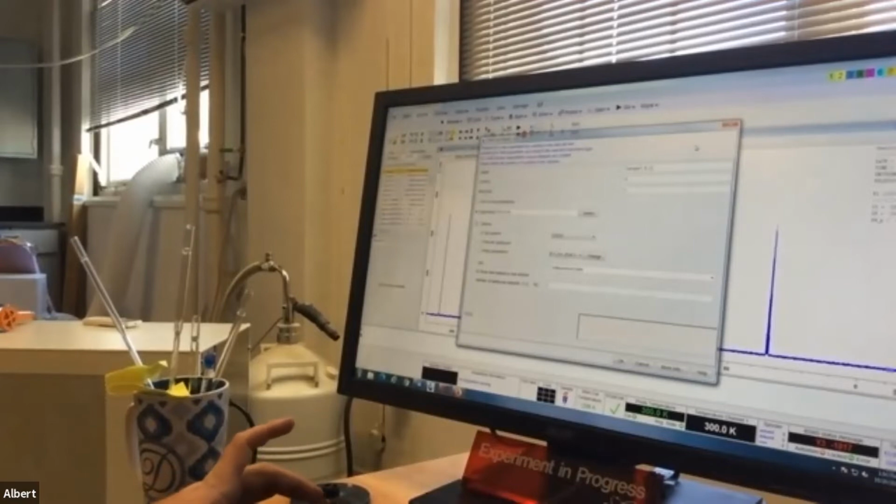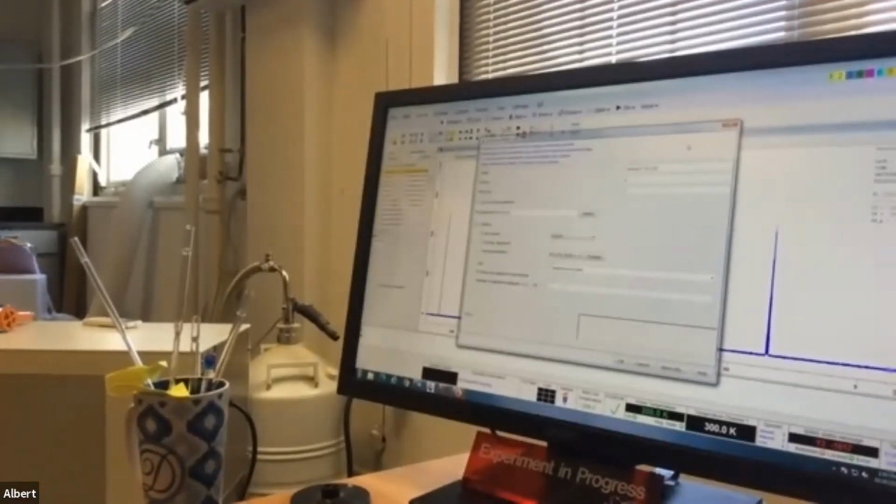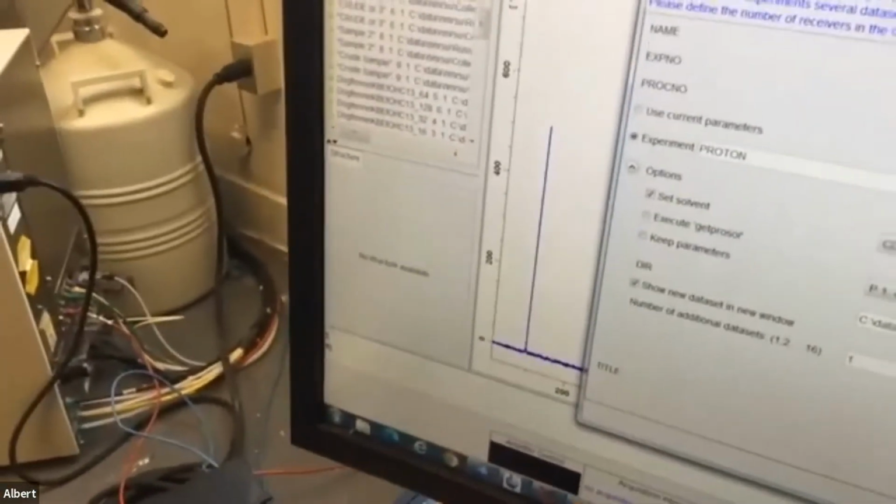Okay, take the dash between 3 and 0.2. That's O2. And then, okay, so yeah, that's fine. Now we put the sample name in. There's a couple of things we need to do. Right there where it says experiment, you want that to say Proton.